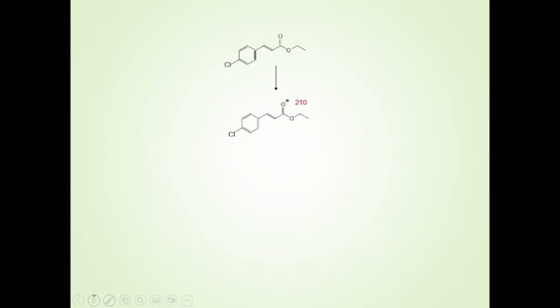Okay. So let's talk a little bit about what's happening when that goes in. Sample comes out of the gas chromatograph, goes into the ion source. It's ionized, and so we get a molecule, or now an ion. In this case, this is what's called the parent ion. This is the original molecule as it came in. It's ionized. And if we have our spectrometer set to, or the quadrupole filter set to 210, we'll be getting hits telling us there's something coming in that has a mass of 210. And so we know that we have a parent ion there with 210.